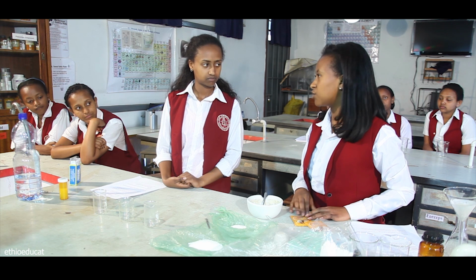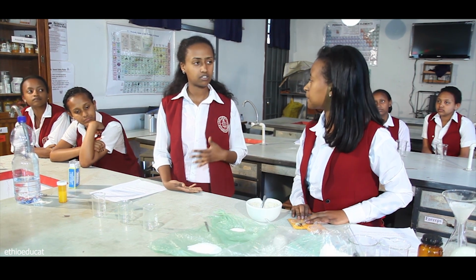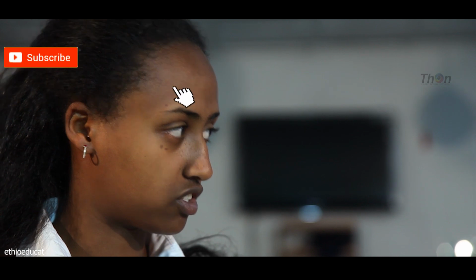Today we're performing experiments regarding the solubility of substances, what affects them, that is the factor, which can be temperature, surface area, or using a stirrer. That's what we're going to do. In addition, solubility is affected by temperature and pressure, the chemical nature of the solute, and the chemical nature of the solvent. Yes. So what do we have here?